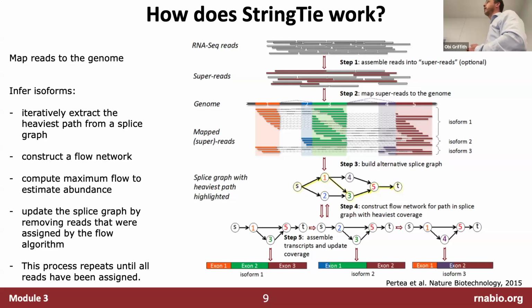And part of the reason why we make this simplification is because this is a hard problem, and StringTie is a very sophisticated attempt to solve it, but there are some limitations with short read sequences, so you can't always estimate at the transcript level accurately. And then the other problem is that a lot of the downstream tools just don't have that level of sophistication, right?